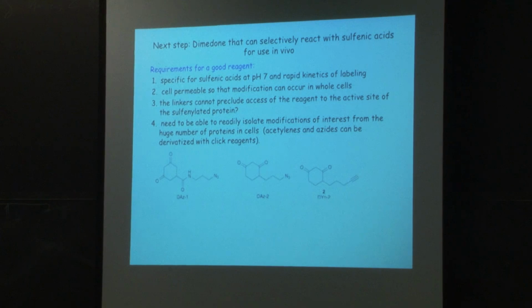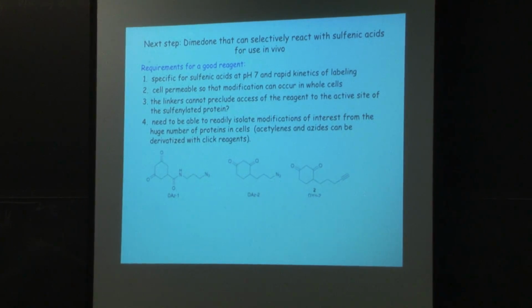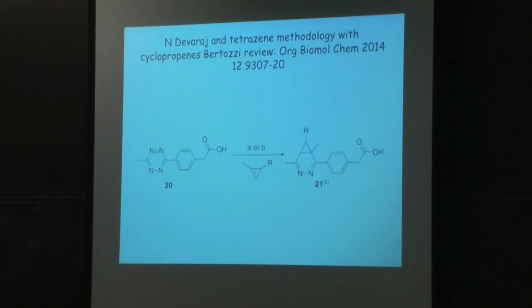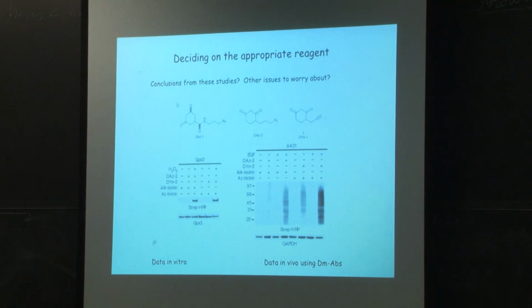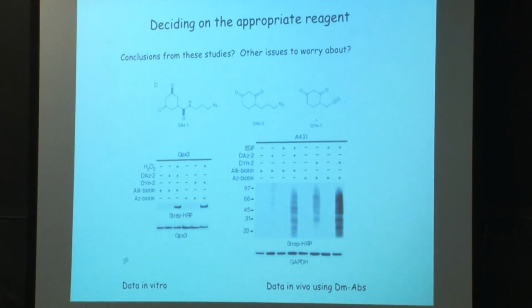Is it? Okay, so let me see if it's 2D. So I have this on a slide. I can go forward. So the question is, which one of these guys do you want to use? Alkyne. Okay, why? Well, in their preliminary experiments, it works the best. Okay, so this is the experiment. So what is this? Somebody wanted to describe this experiment to me.